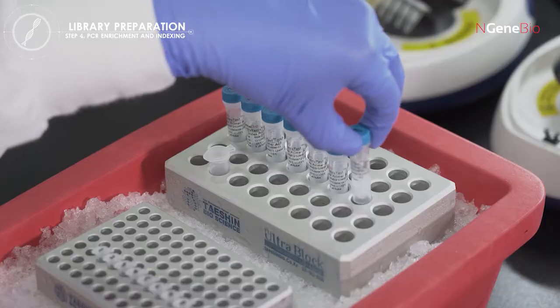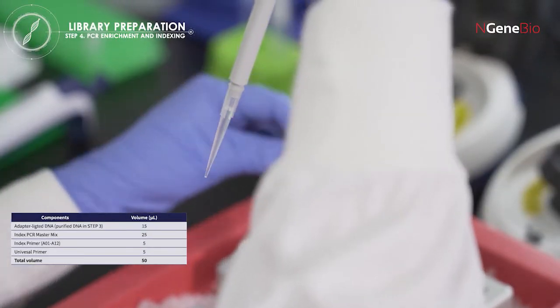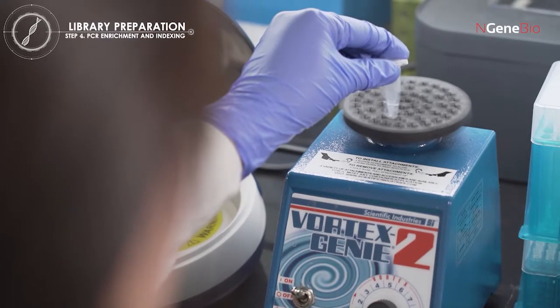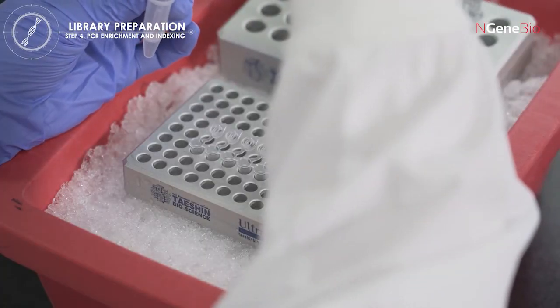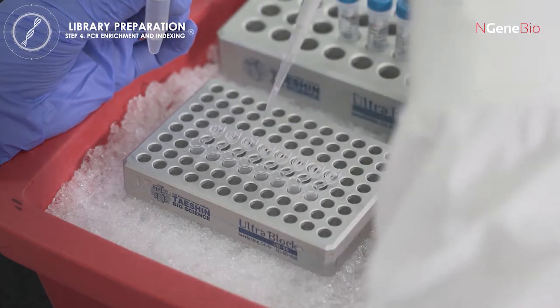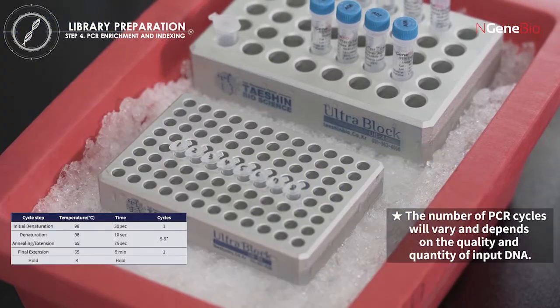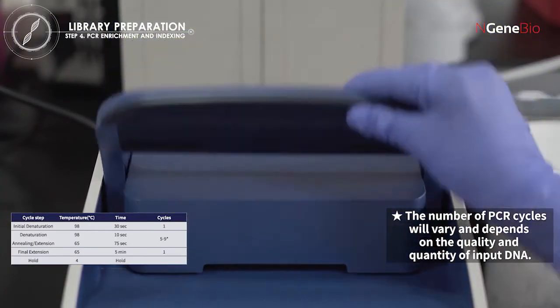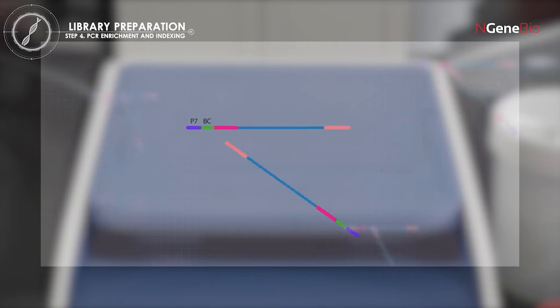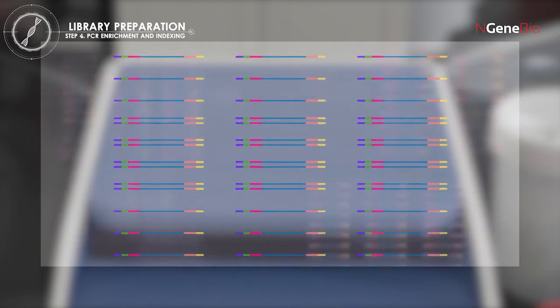Prepare the blue cap tubes marked as 4 and each index primer depending on the sample number. Make a master mix into a new tube adding calculated volume of index PCR master mix and universal primer. Aliquot 30 microliters of the PCR master mix into each tube containing purified DNA and add 5 microliters of each index primer per sample. Place PCR tubes in a thermal cycler and run the PCR. During the PCR reaction, the adapter-ligated DNA template is amplified along with each index. Index primers play a role as a unique barcode identifying each sample on multiplexed sequencing.